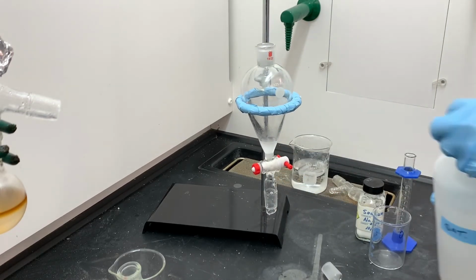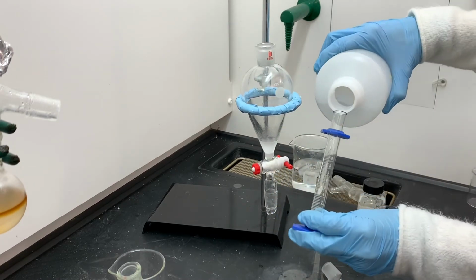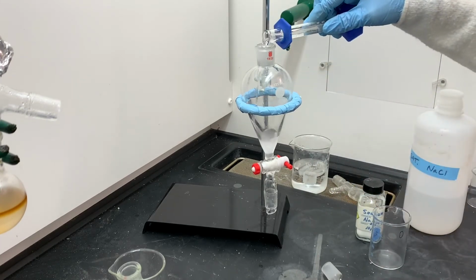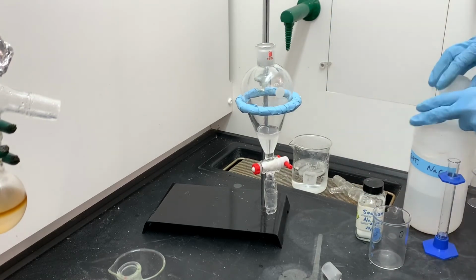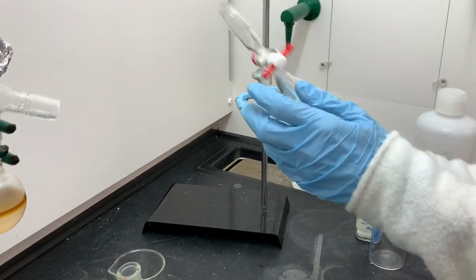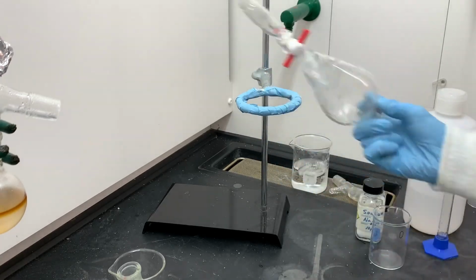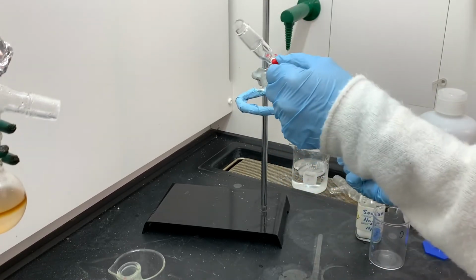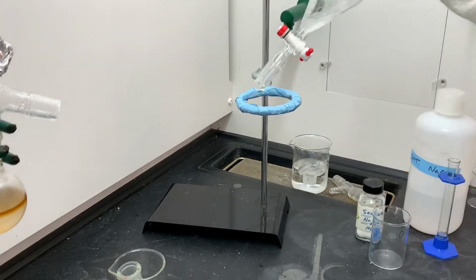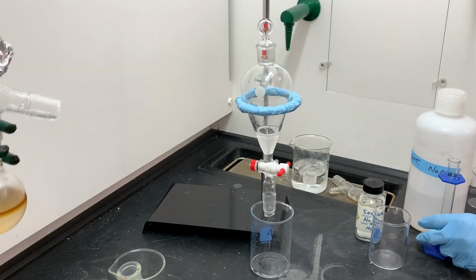Now I'm going to wash or rinse this with saturated sodium chloride, about 5 milliliters, except I'm going to way overshoot that, so it's about 8 milliliters. Saturated sodium chloride is extremely polar, because it's water, which is polar, and it's got sodium chloride, which makes it even more polar. That's going to help remove any impurities that are inside that organic layer. I'm shaking, venting, allowing these two liquids to mix together. The saturated sodium chloride is down on the bottom layer.